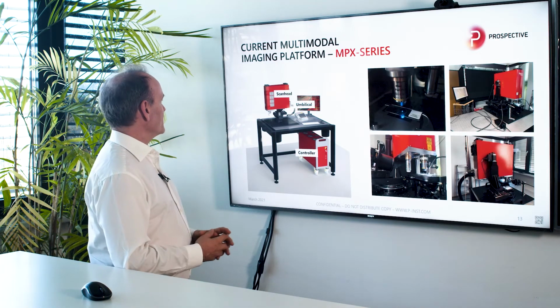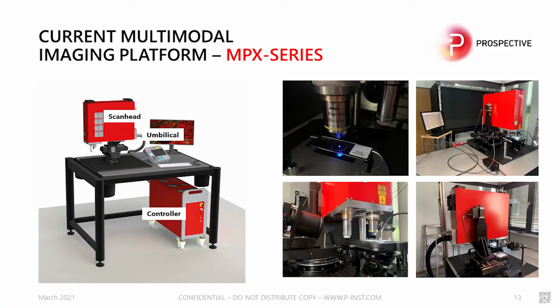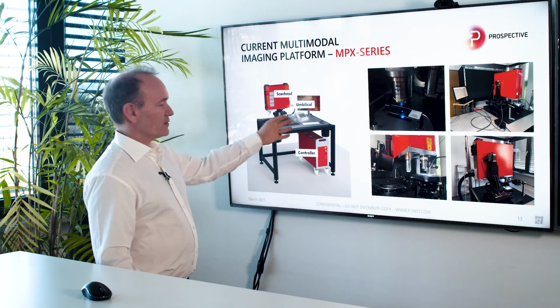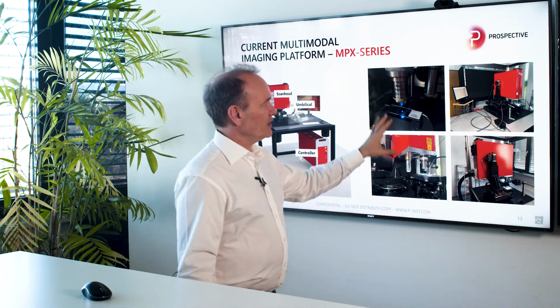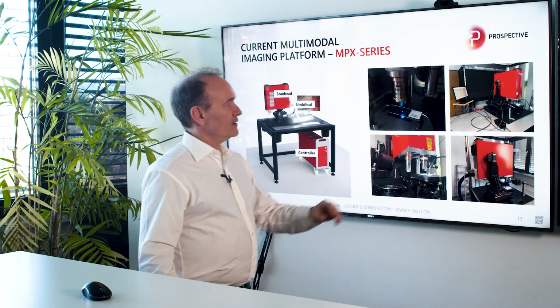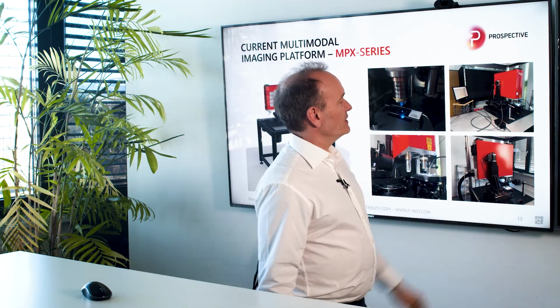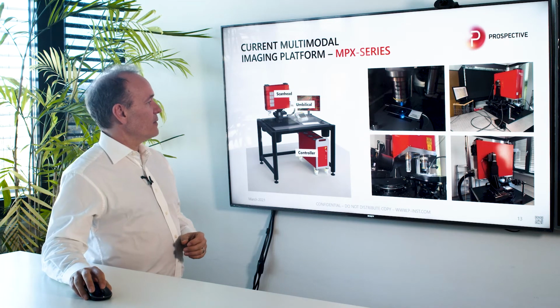So that's how it looks like. Here you see a rendering of our system, and there are some real pictures of our first prototype. Basically it consists of a controller which comes underneath the table. There's an umbilical, and you put the scan head and your monitor, PC, mouse on your table. You can see here some real pictures from our lab, actually. This is the first prototype that we built. The red box illustrates the scan head, as we call it. And you can see here we are trying to image some samples in our in-house application area.